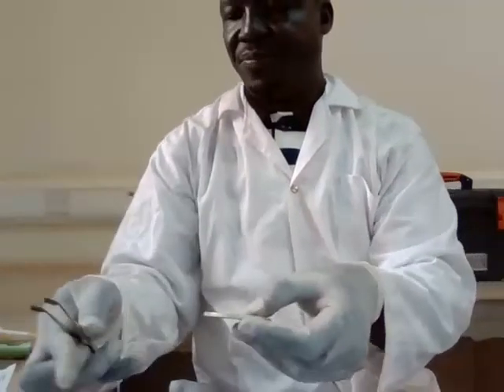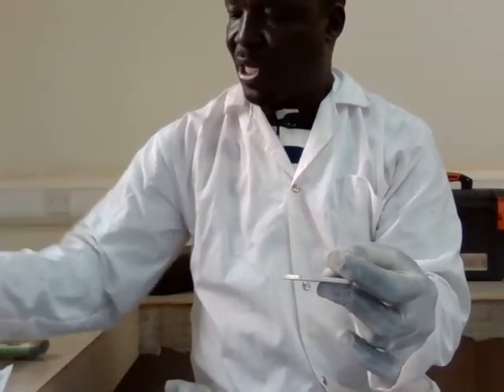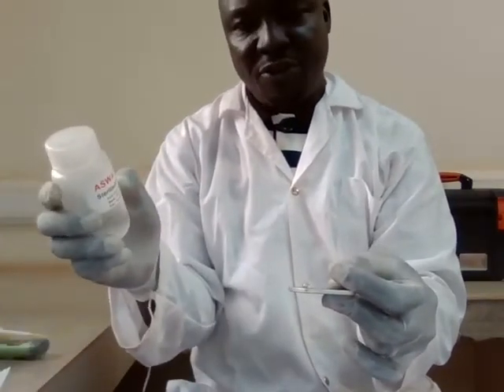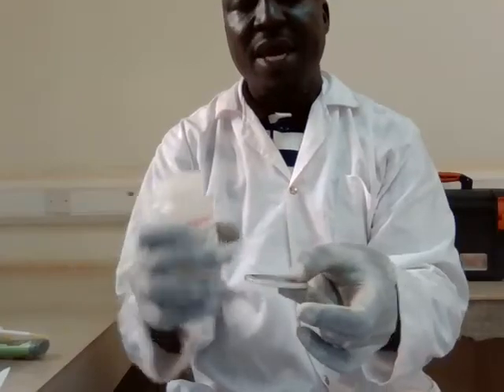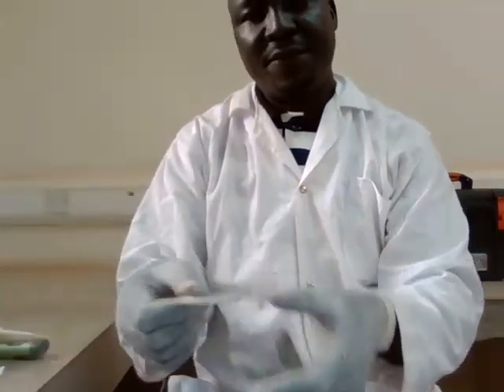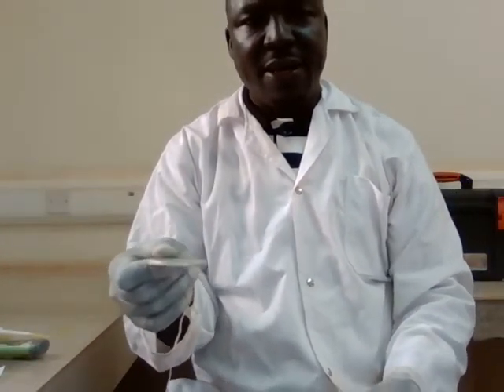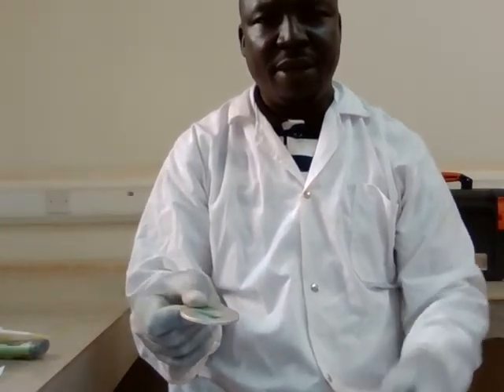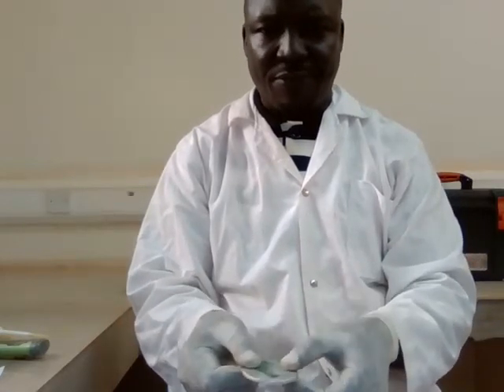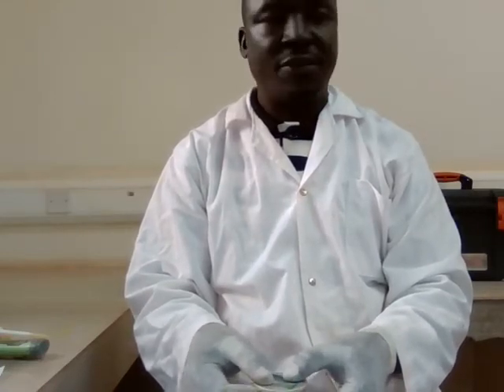At this stage, you're supposed to label. Label this with the name of the specimen or the specimen number, and the same number should be on this surface. Okay. Then after this, you take this into the incubator. I mentioned earlier that we have equipment called an incubator. So this incubator provides the right food temperature when you're culturing.